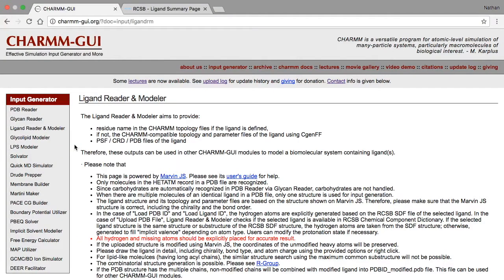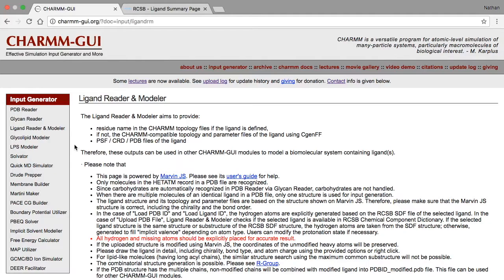In the previous videos, we showed how to generate a small molecule by drawing it, and how to read in and modify a small molecule from an existing PDB structure or from the RCSB ligand library. In this video, we'll show how to generate many structures by giving a list of substructures to combine.